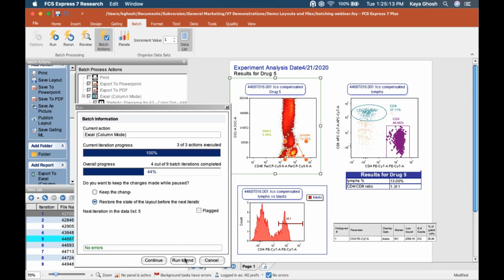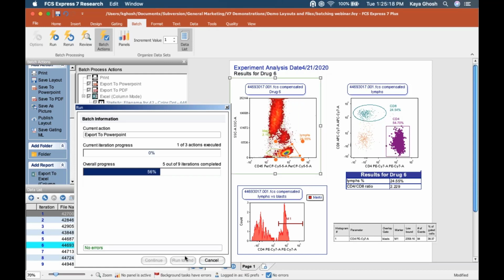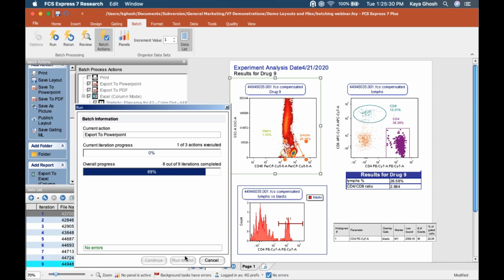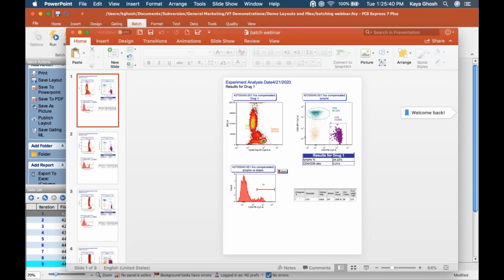I see one person had a question about the axes. So that has to do with, if you see the axes min and max jumping around a little, just feel assured that your gate boundaries aren't changing. Your gate is numerically the same, but bi-exponential gating was an algorithm developed by BD, and it does adjust based on the range of your particular data file. Now, there is a way to fix that, so it's stationary between the samples if that bothers you, and so we can send you a manual link to that afterwards. I know that's a question that comes up during batching, but we won't cover it in detail today because it's not about batching per se. But thank you for the question.